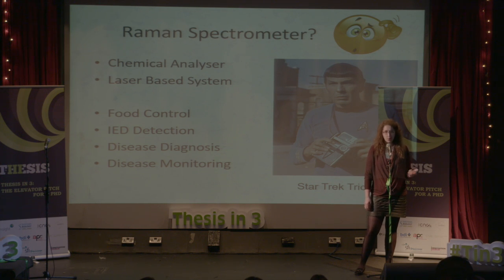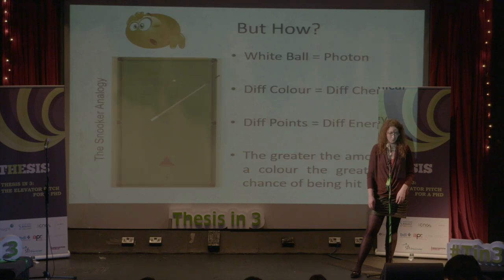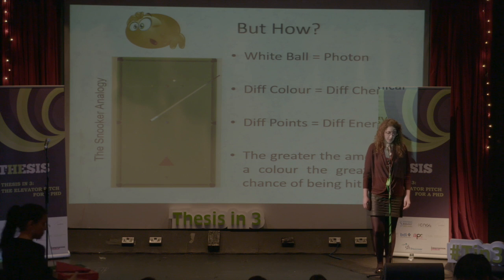So now on to the tricky bit. I don't really want to bore you with the physics of how a Raman spectrometer actually works. So I'm going to employ something that I like to dub the snooker analogy to Raman spectrometry. Okay, so how does the Raman spectrometer work?